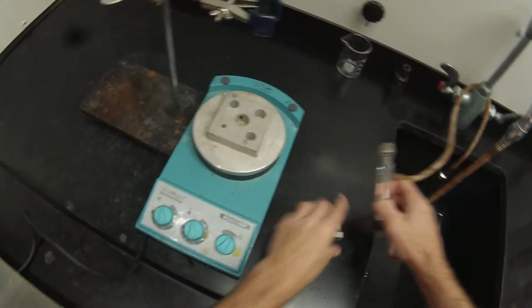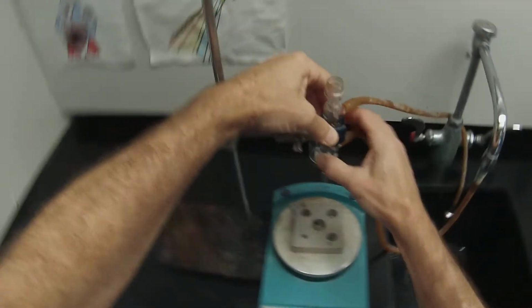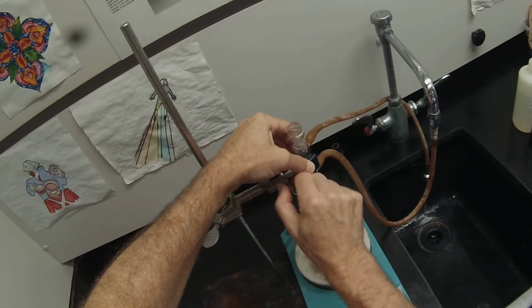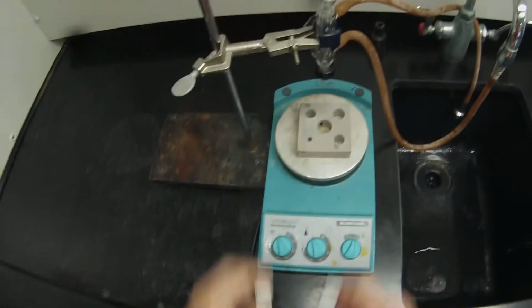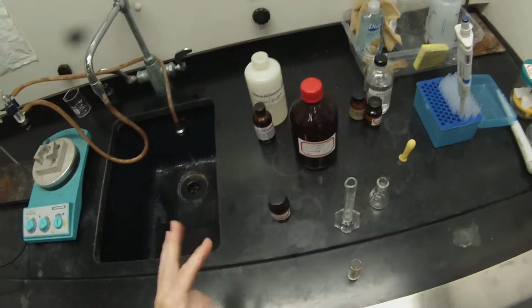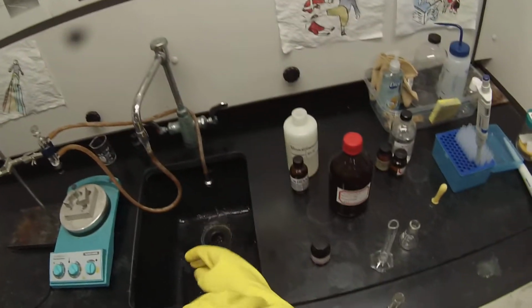Actually, to be safe, let's clamp that. So we'll move this close enough we can fit that in there. And we'll eventually want that centered over the plate. And it looks like we'll be able to get that on there pretty well. Alright, so I'm going to put some gloves on to dispense the concentrated acids. Don't really want to get the concentrated acids on me. N-butanol will come from that. These two things are for the workup, sodium bicarbonate and the hexane, when we do our little extraction.